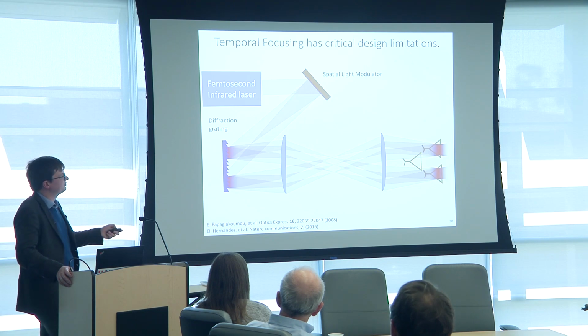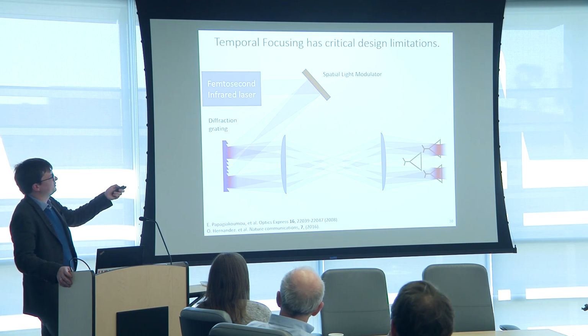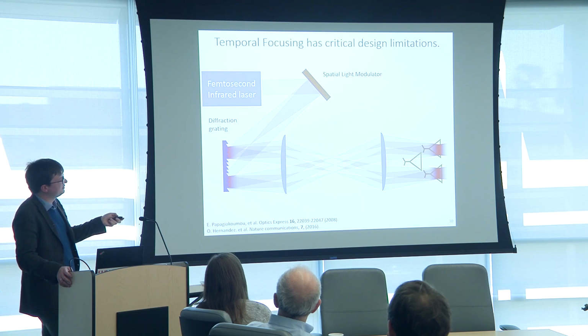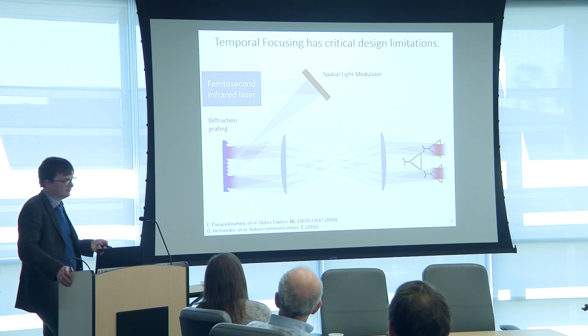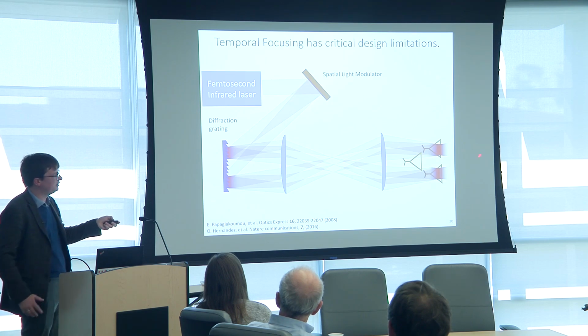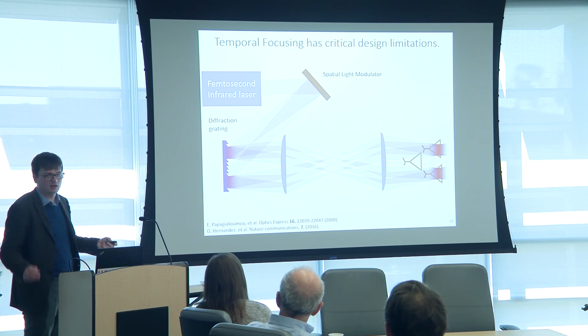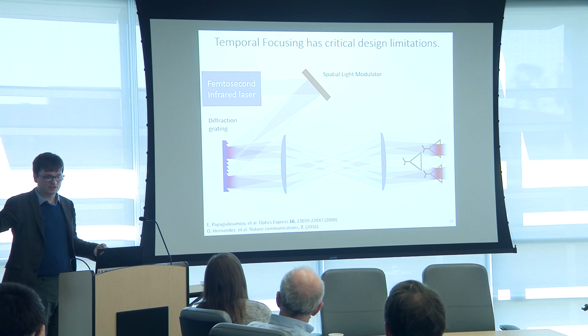Yeah, so for instance, the spatial light modulator here, I'm missing a lens to create the hologram. But the idea is that you would have this assembly right before the tube lens. So for instance, this would be a magnified 3-dimensional or 2-dimensional object that you would then relay to your brain via one tube lens and the objective to demagnify.